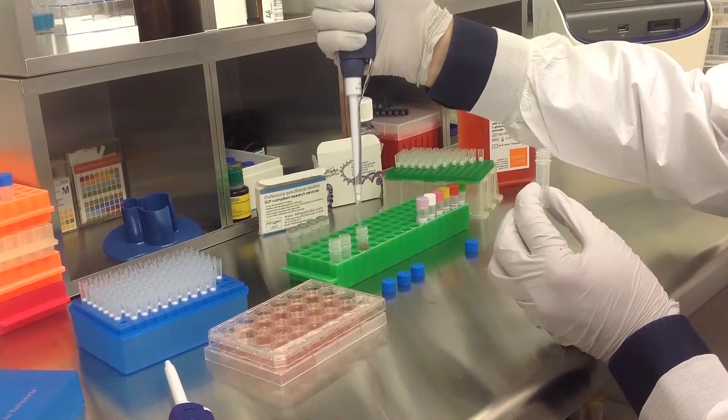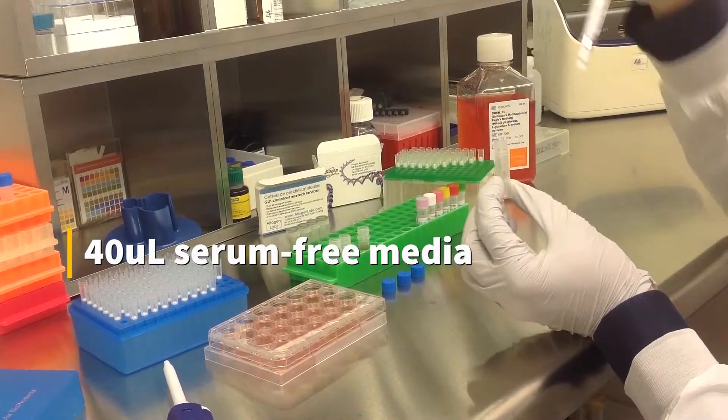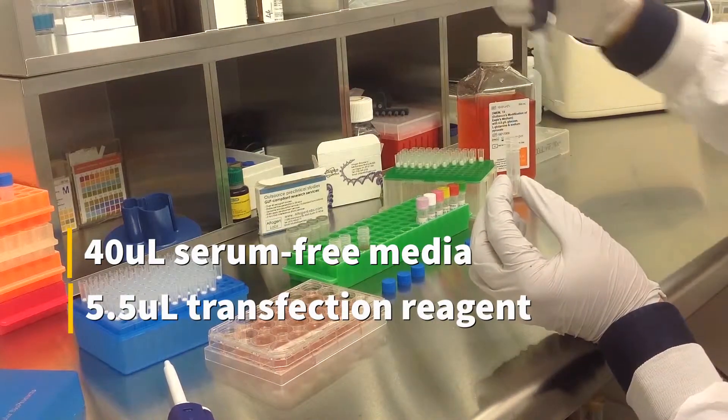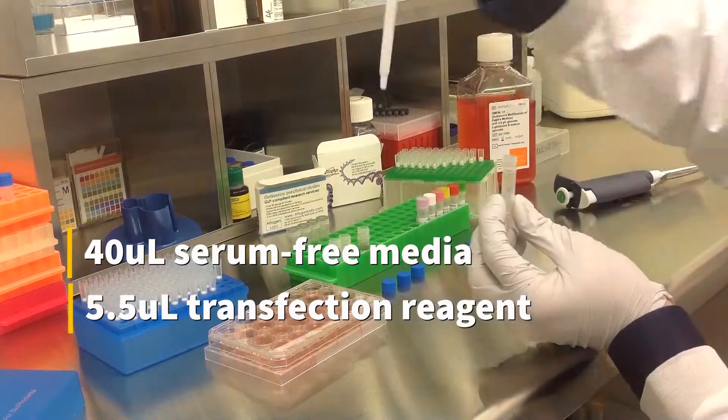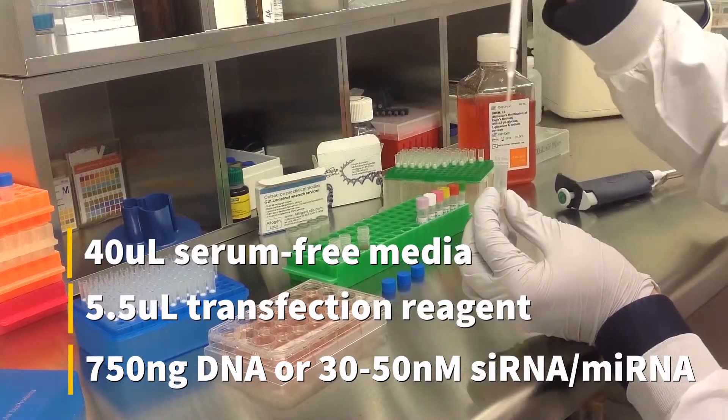To prepare the transfection complex, mix 40 microliters of serum-free medium, 5.5 microliters of transfection reagent, and either 750 nanograms of DNA or 30-50 nanomolar siRNA or microRNA.